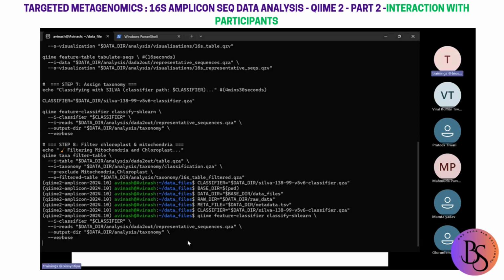Now, the problem with this step is that it is an extremely intensive step. Okay? It will take a lot of time to execute. Fine. So what I have done is I have prepared two files. Okay. I have prepared two sets of files for you. One is a truncated file, and that is going to be your assignment. Okay. That is going to be your assignment. I will get an idea of how many of you have actually understood this whole pipeline.